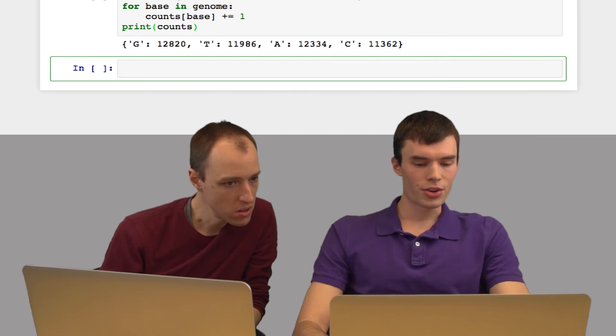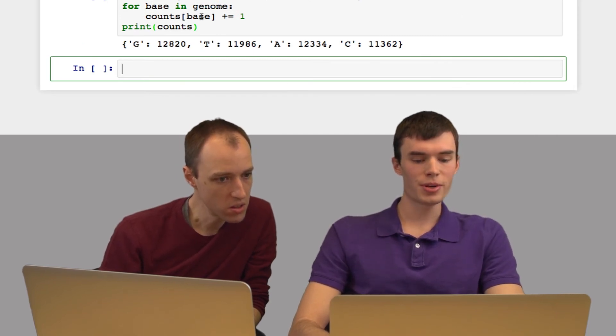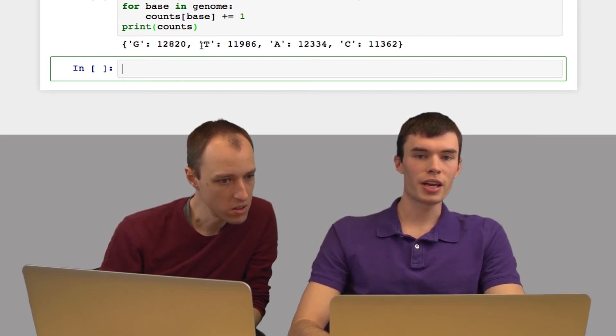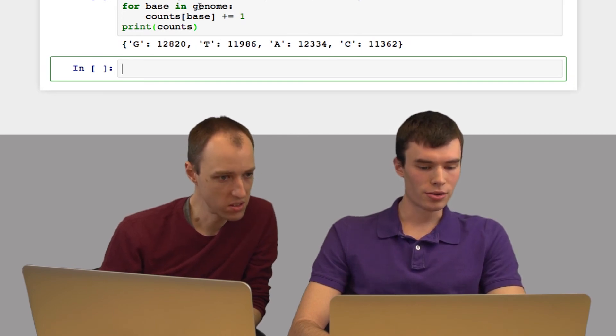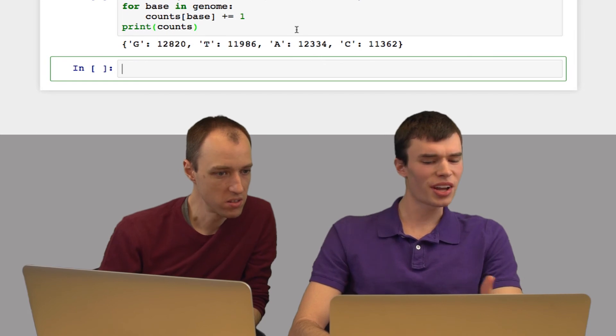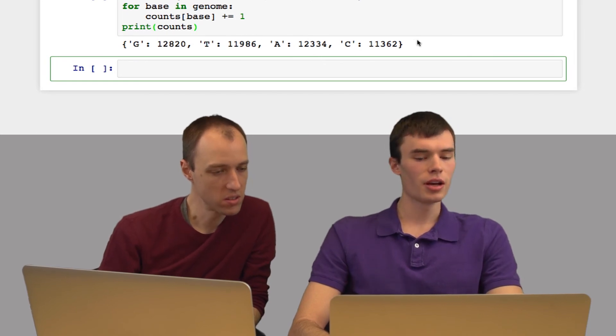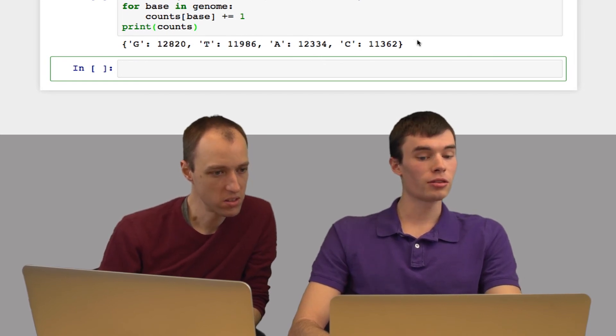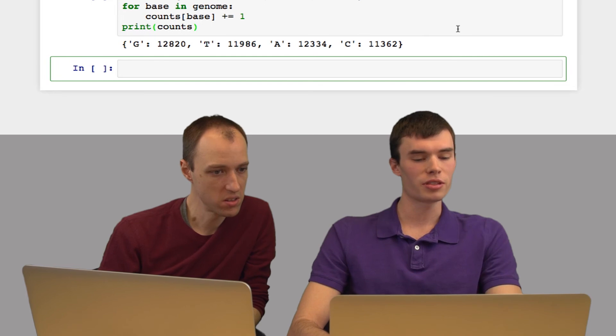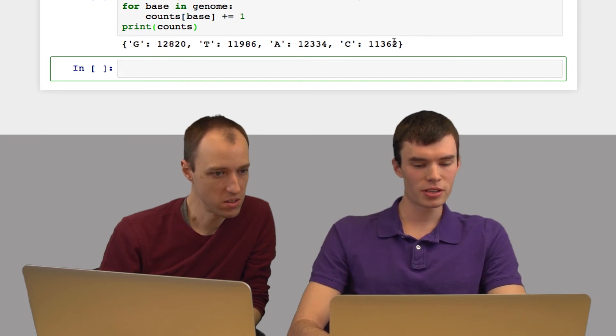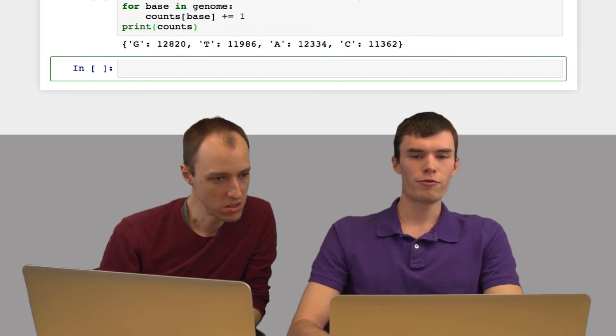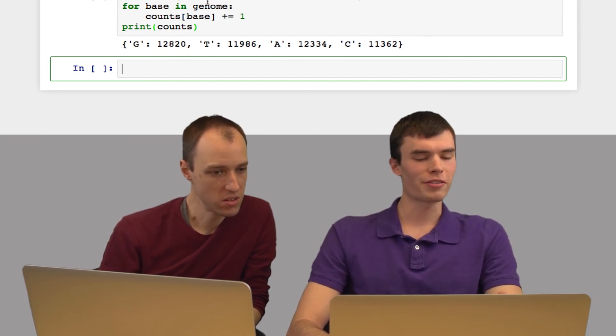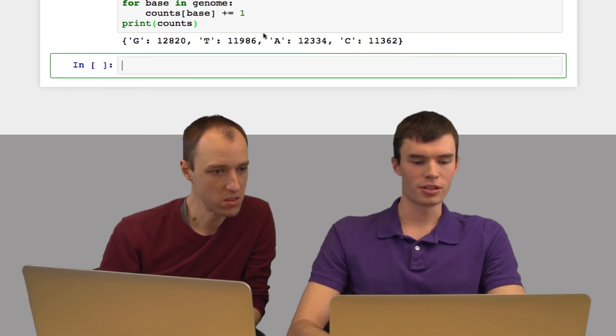And so here we go. You can see for each base, we have a number indicating how many times that base appeared. You can see that G and A appear slightly more frequently than T and C, but there's really not a large difference. There's a pretty even split between them. And if you add up these numbers, they should add up to 48,502, which is the length of the genome.